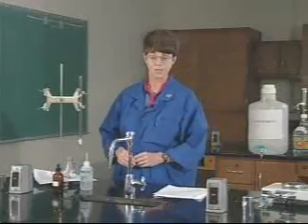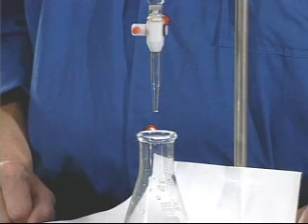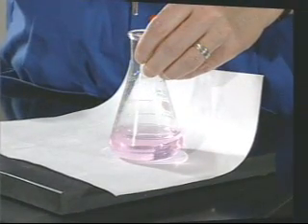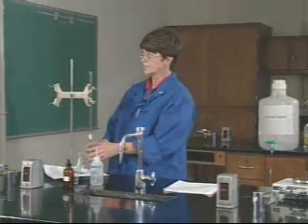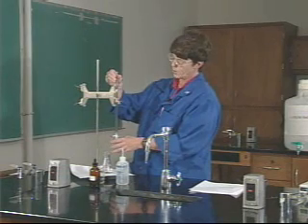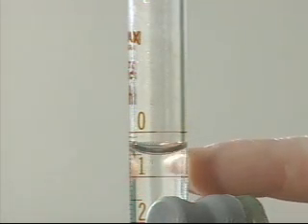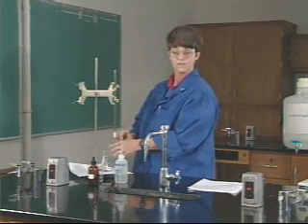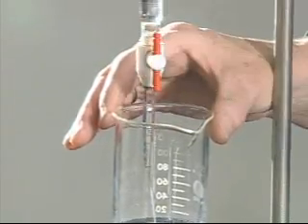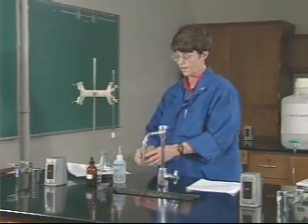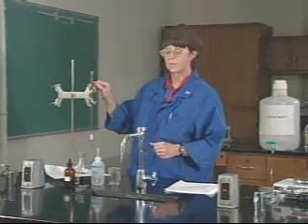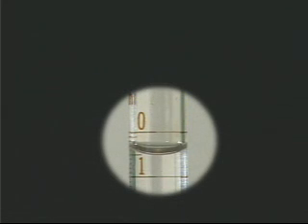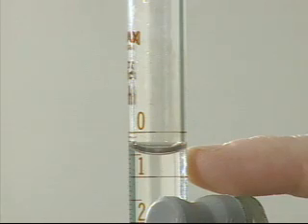Come back to the burette that has the sodium hydroxide in it. You'll notice we have a white piece of paper here because the end point we're looking for is a change to a very pale pink color, and it's much easier to see against a white background. Make sure the burette is ready: the volume should be below the zero mark and there should be no air bubbles in the tip. Record the volume you start with on the burette — this is your initial reading, recorded to two decimal places. The reading here, for example, is approximately 0.85.